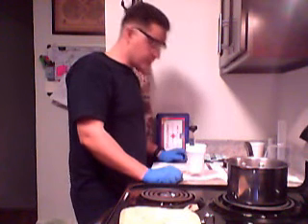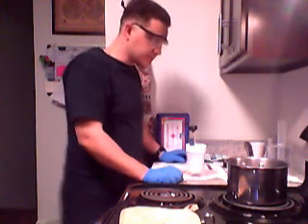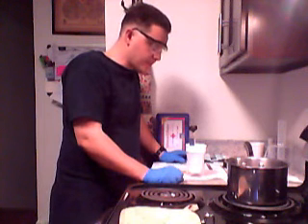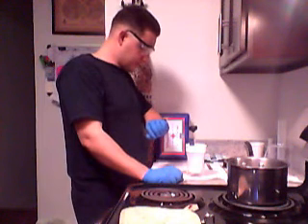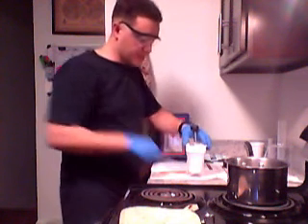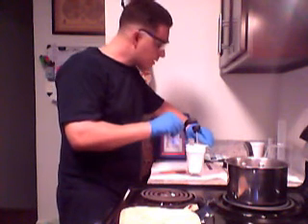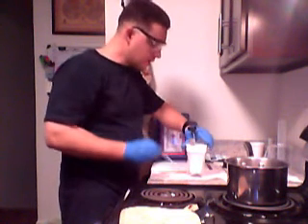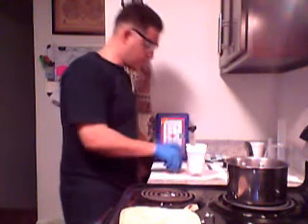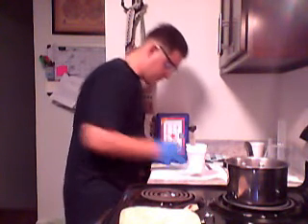Okay, what I'm observing is that temperature continues to go up here very slowly. Alright, we're coming up on 2 minutes. Let's stir it again, without touching, and we're at 23.9 degrees Celsius. Alright.